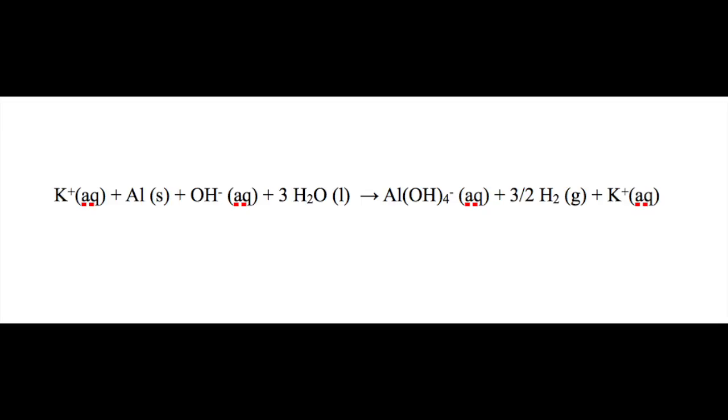In order to prepare the solution that yields the formation of alum crystals, we started by dissolving scrap aluminum foil in potassium hydroxide solution. This reaction yielded hydrogen gas that bubbled out as the reaction proceeded, and aqueous aluminum ions in a basic solution. In order to speed up the reaction, the beaker holding the aluminum-potassium hydroxide solution was placed on a hot plate and mixed using a magnetic stir bar.